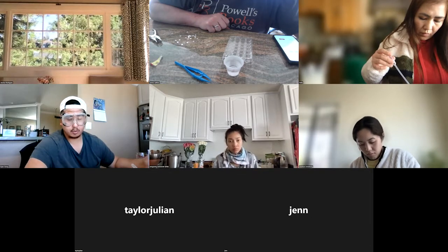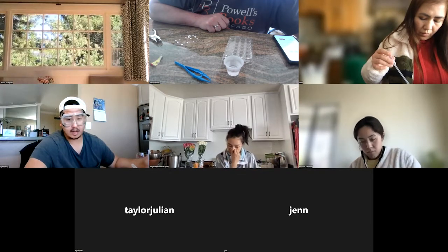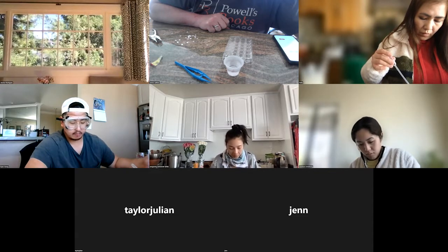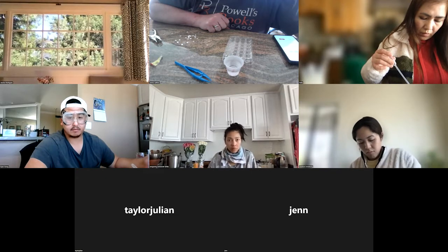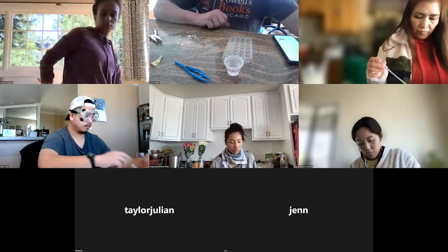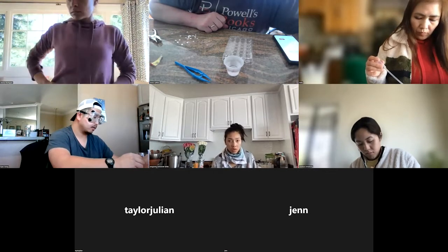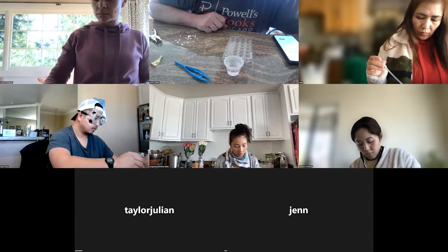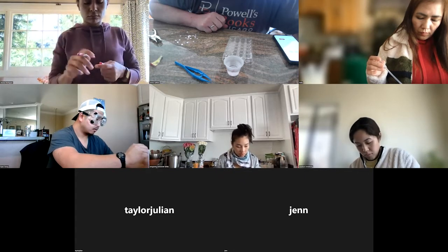I did the 25% diluted catalase, and those didn't yield any results whatsoever. But the 50% dilution of the catalase, it started to show up. Wow, even the 25% didn't do anything. That's surprising. Yeah, I'm coming up on 4 minutes with nothing here.